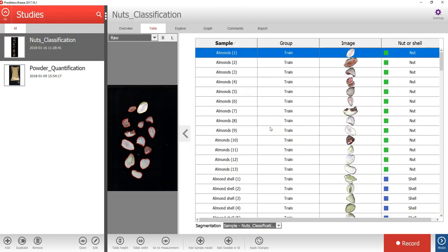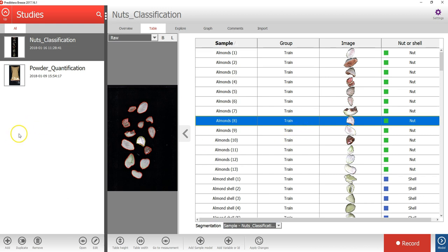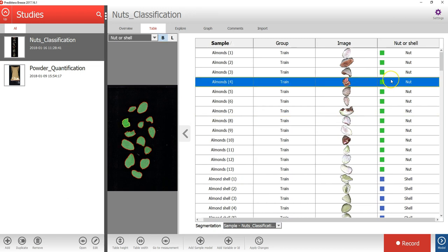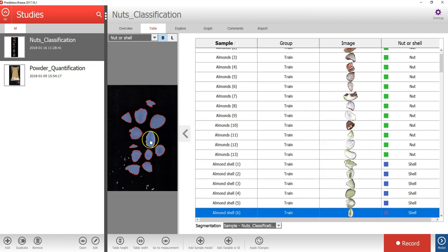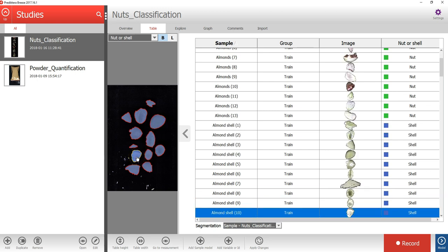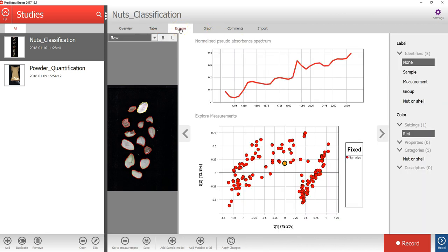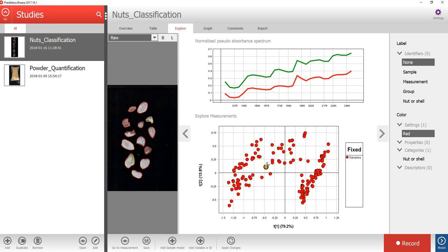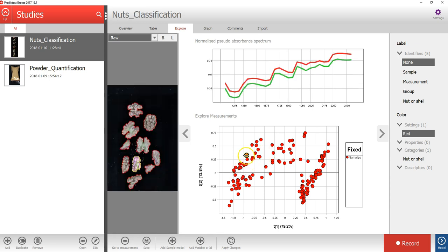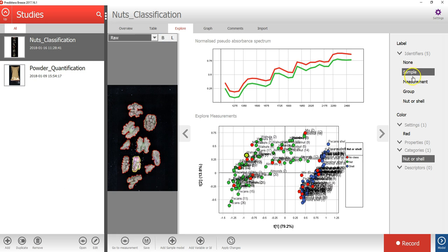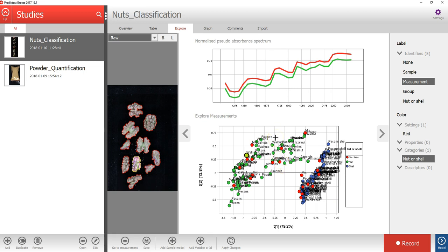In the table for the study, you can now see all the sample objects in the images after the sample model has been applied and the background pixels have been removed. By clicking in the nut or shell column in the table, you can color all objects in the preview based on the class. You can also click on objects in the preview image to see where they are in the table. Let's press the explore tab. A PCA model has been created based on the average spectrum for each sample object, allowing us to see which objects are similar or different to each other. In the menu on the right, you can select to color the scatterplot based on different category values or add labels. We will now use the average spectrum for each sample object and the class type to train a classification model.